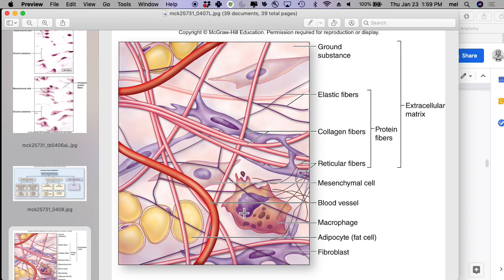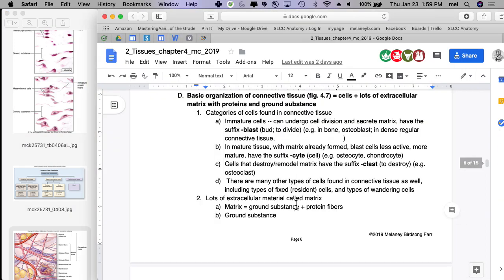Okay, you're going to see fibers. The orientation of the fiber and whether the fibers are bundled or not and what kind of fibers will tell you something about the structural stability of the connective tissue. And then you're going to see this stuff, which is neither cells nor fibers. And ground substance is such a general term that it doesn't mean much. It means I'm not cell, I'm not fiber, what am I? Well, if this was blood, that would be 90% water. But if this was bone, that would be mostly calcium crystals, right? So the ground substance is the stuff that is neither cells nor fibers, and it really varies a lot from tissue to tissue, what's actually in there. Is that okay?